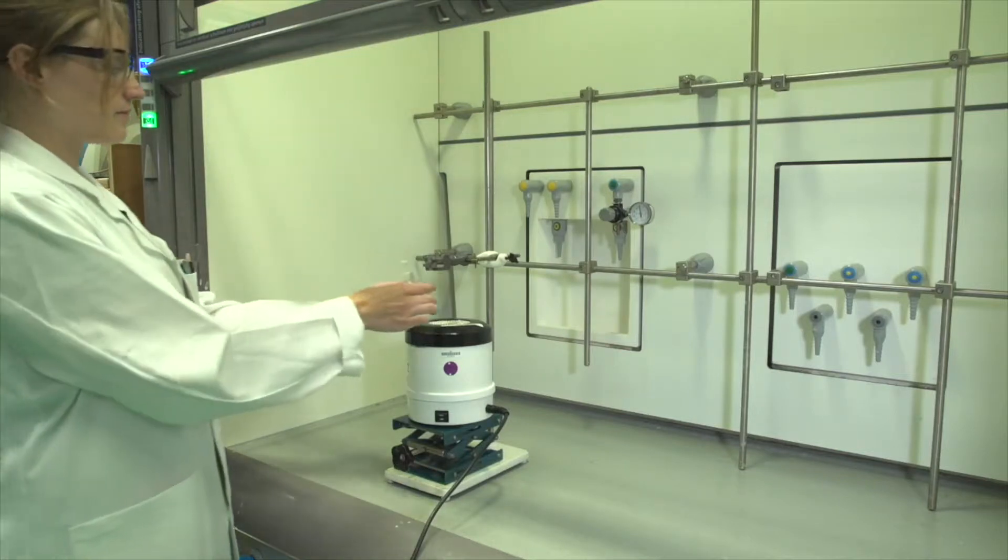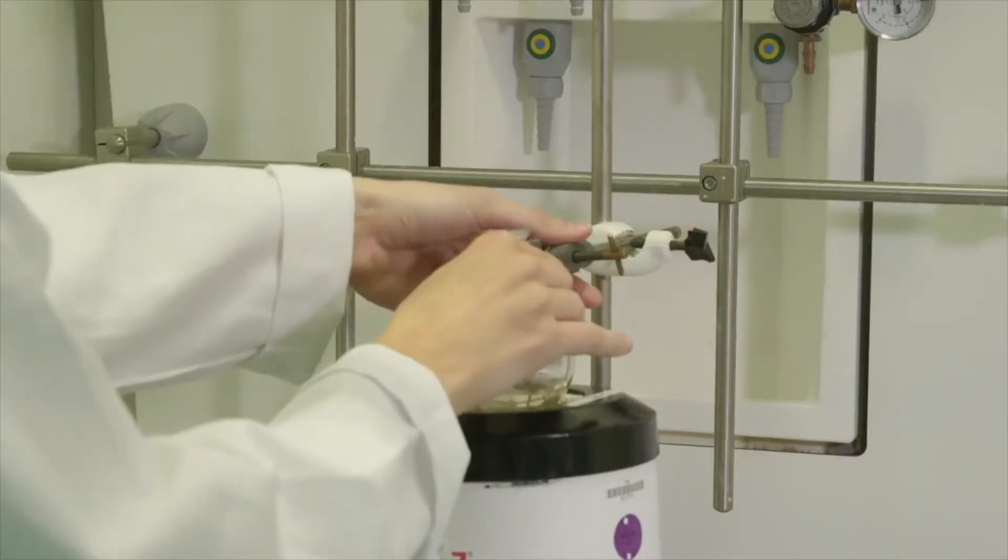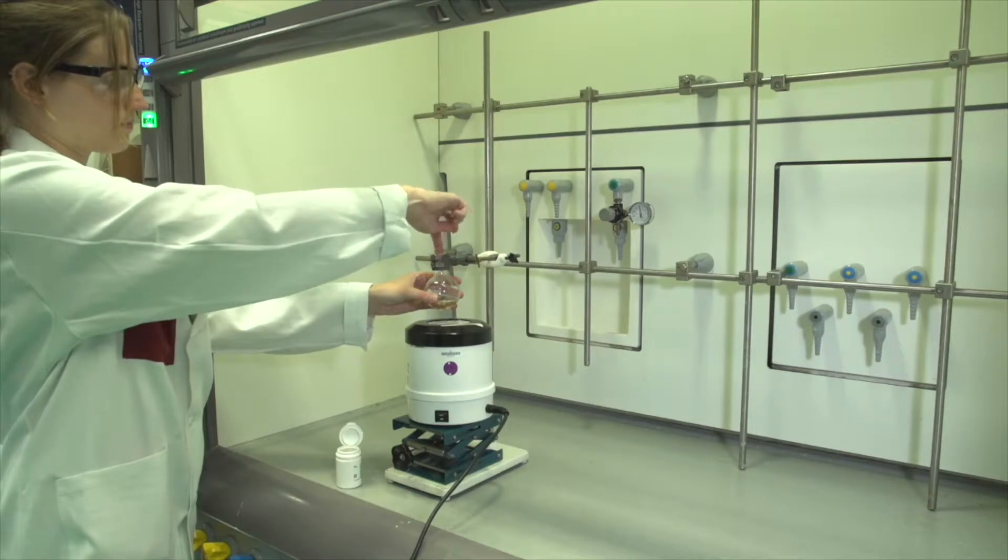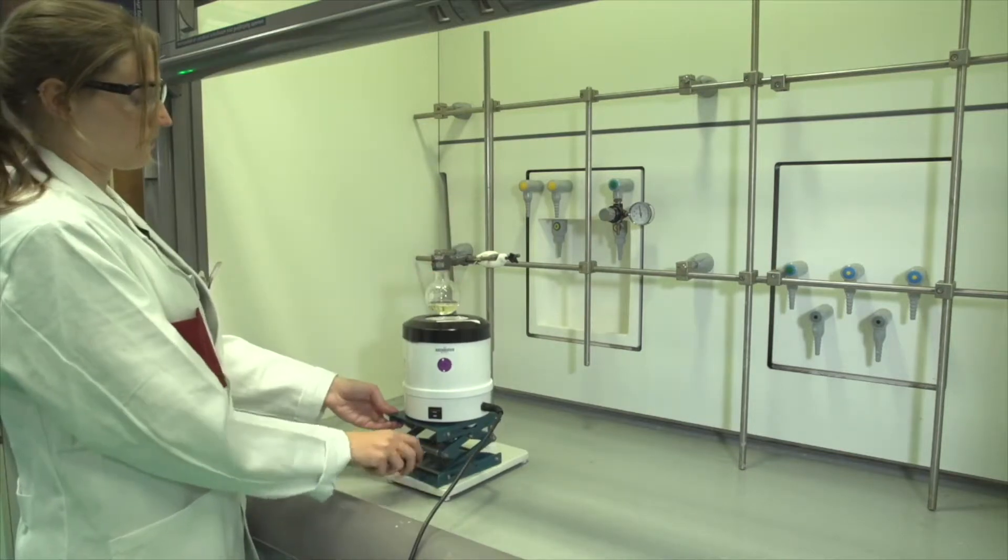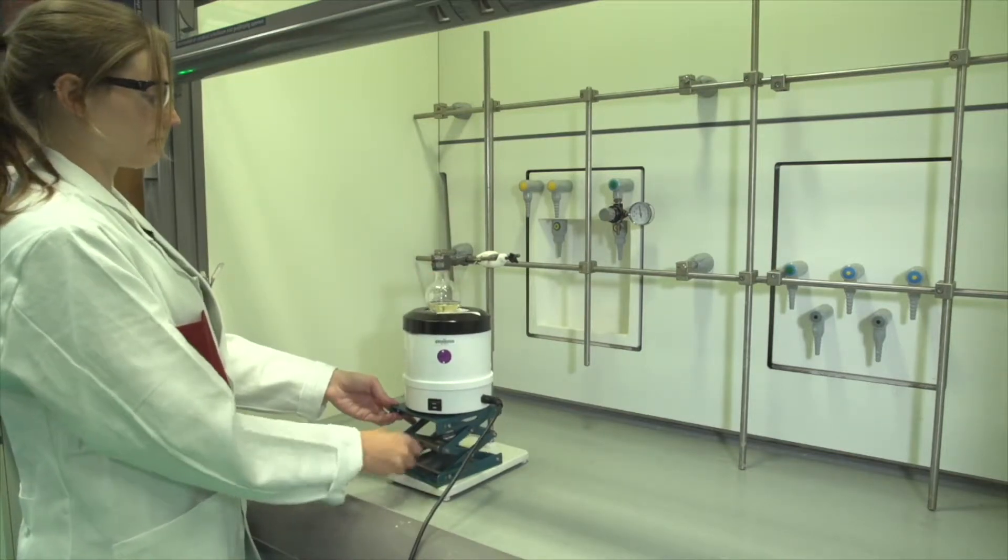The round bottom flask with the sample is fixed into the clamp and the neck is lubricated with grease. Lift the isomantle with the jack until the flask is surrounded by the isomantle.